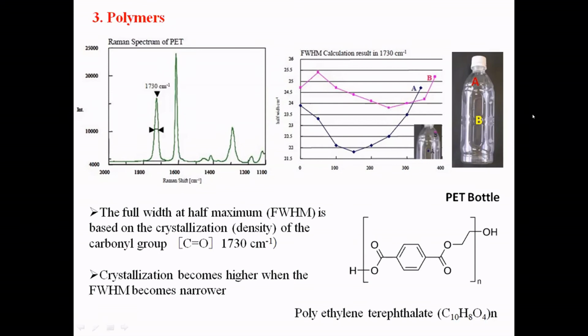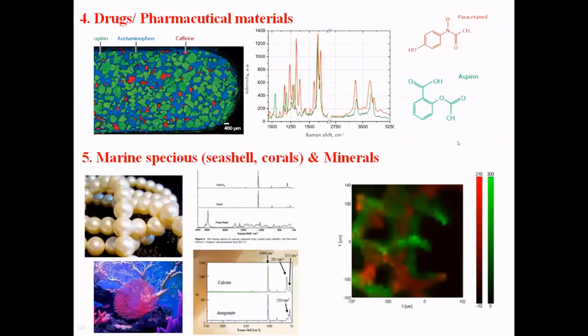And the pharma, of course, as I told you, the mapping part is highly useful for their applications, because they mix a lot of organic substances with different ratios. It's a very precise compositional material. So if you do one mapping, it's a complete fast scanning or surface scanning.